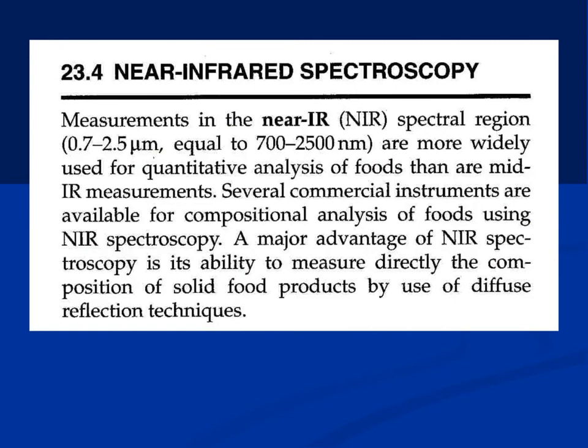The detector is now standardized to determine that fingerprint. So it is fed into the microchip that if these kinds of reflections are coming, then water is present, or if this is so high, then 10% is present. If it is higher, then it is 20% moisture. So that's how you standardize it, and then these instruments are very quick in industry in various ways to determine the protein content directly or moisture content directly.